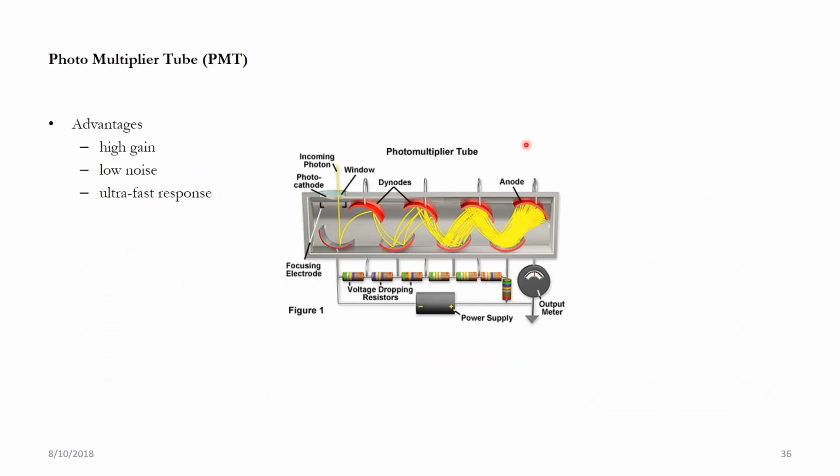So if you talk about the photomultiplier tube, or a PMT, it's a very simple device where the incoming light hits a photoelectric panel where, due to photoelectron generation, an electron is generated which is then multiplied over multiple stages. How does this multiplication happen? So imagine this to be a loaded apple tree which is bearing lots and lots of apples, and now you throw one apple onto it, hundreds of apples fall down.